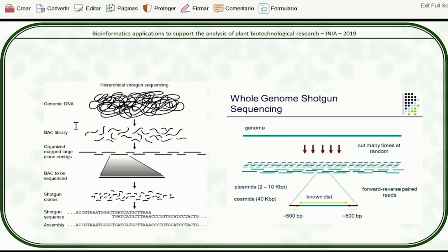They just took a bunch of BAC sequences or BAC clones. They put in a series of restriction enzymes. They looked at the restriction fragments, the sizes, and whichever two BACs started sharing the same fragments, they would say, all right, these two BACs that share many fragments using the same enzyme are probably overlapping. And since they are probably overlapping, they should be contiguous to each other.